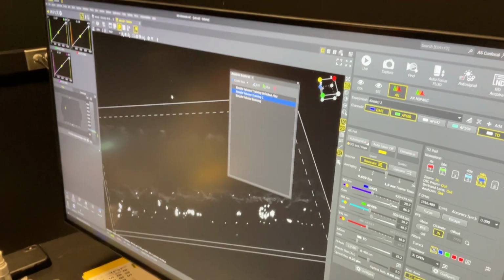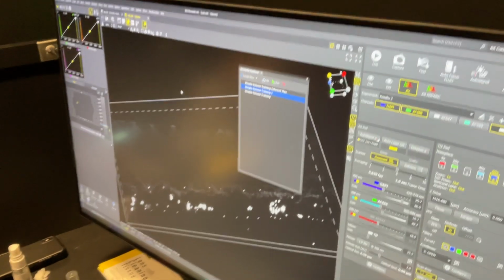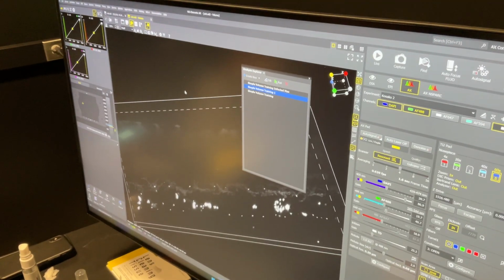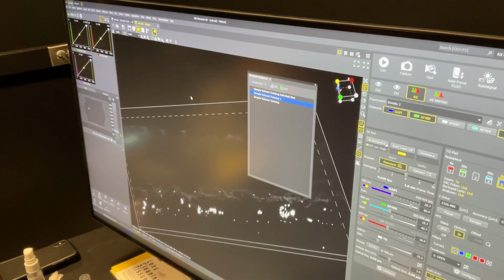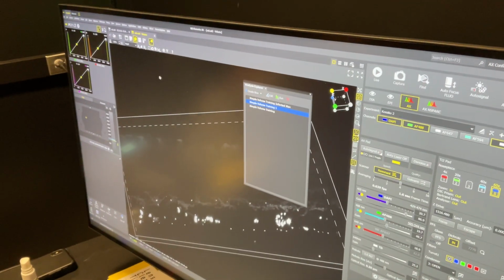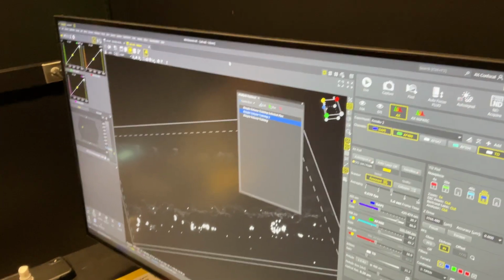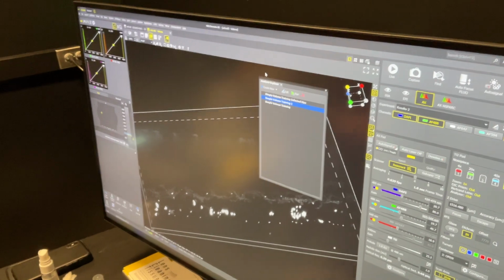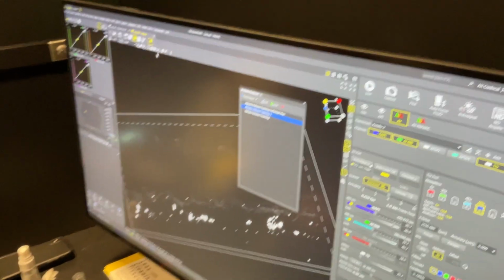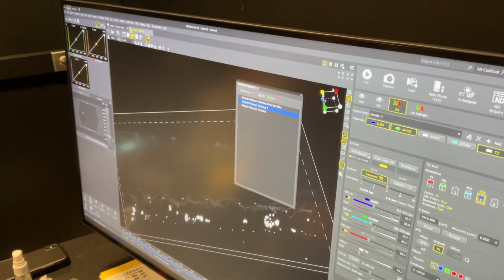The cost depends on the modules, because you buy the baseline and then the modules are extra. GA3 lists at a little over $2,500 for just that module. AI is like $5,000. Decon is like $10,000. Decon's super expensive. What did we take last time over here? We definitely have some relevant ones in there, Josh.